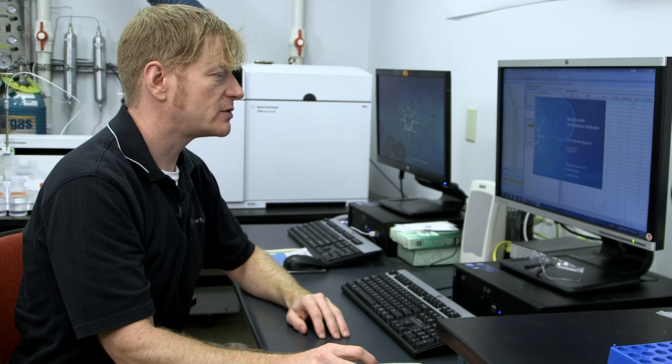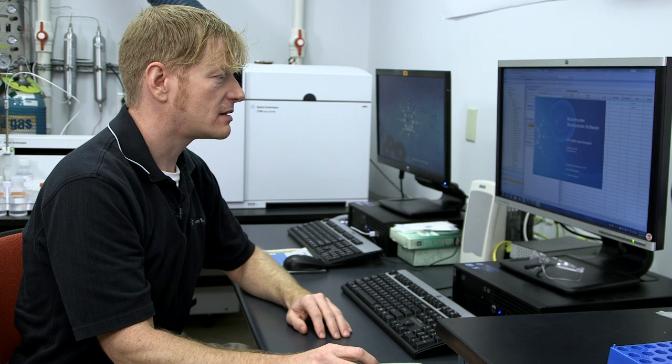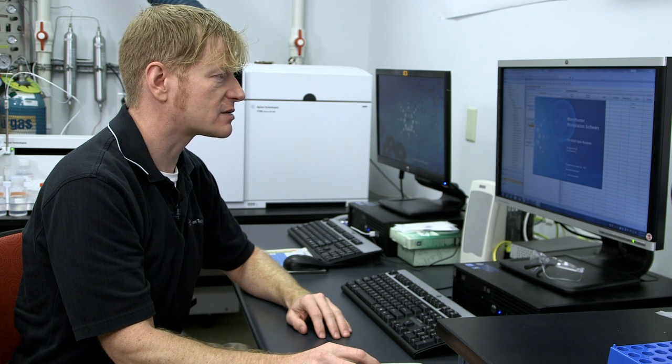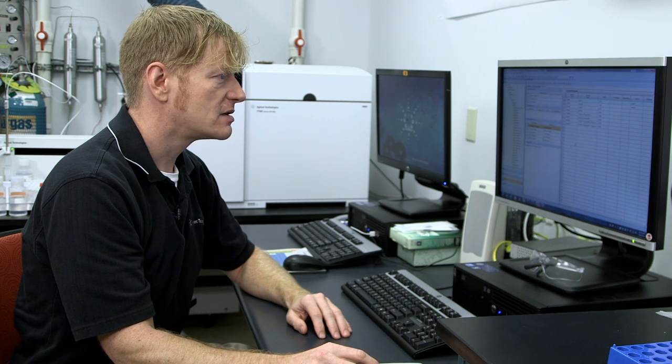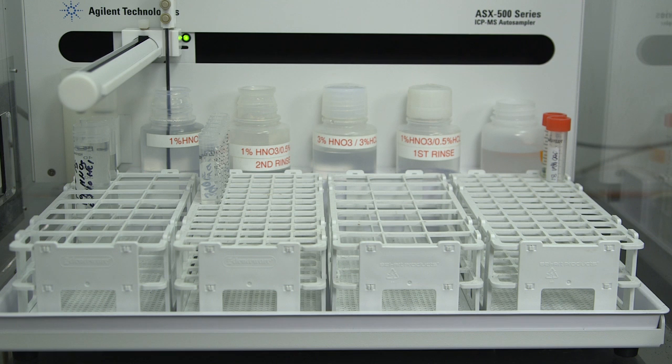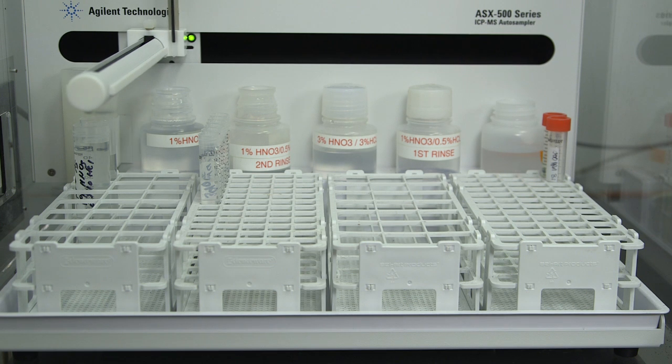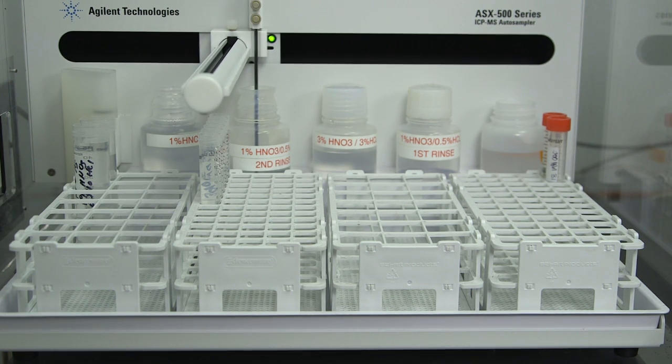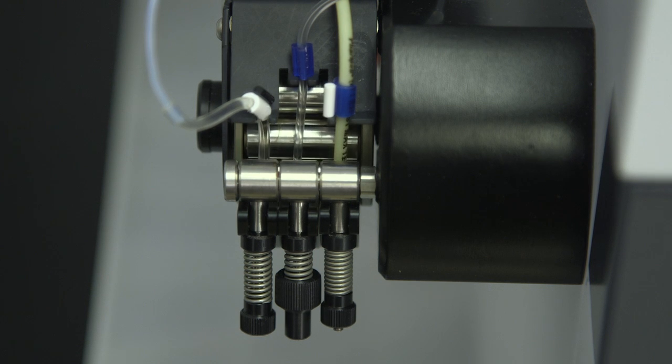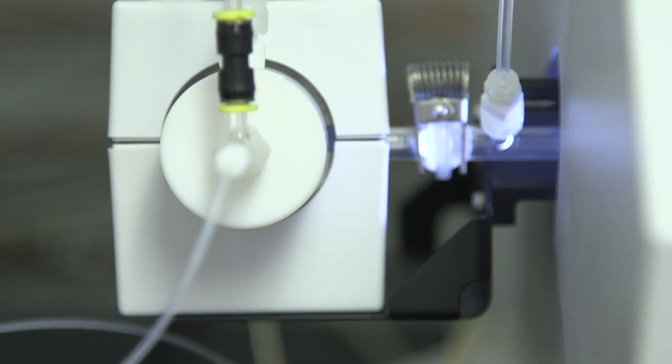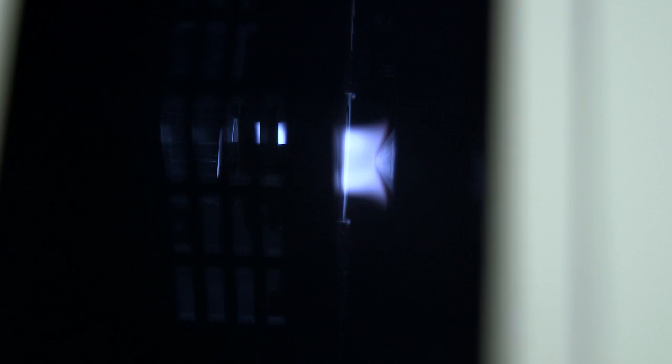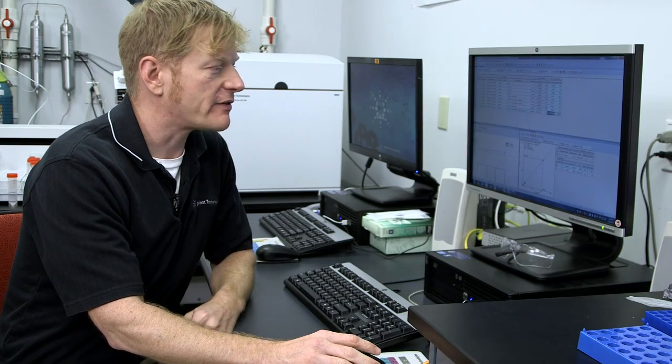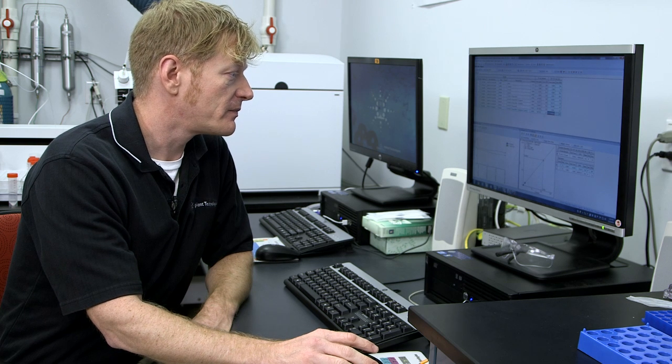Once we do that, the ICP triple quad data analysis window opens, which stores all our data and populates real time with the analysis that we're doing.